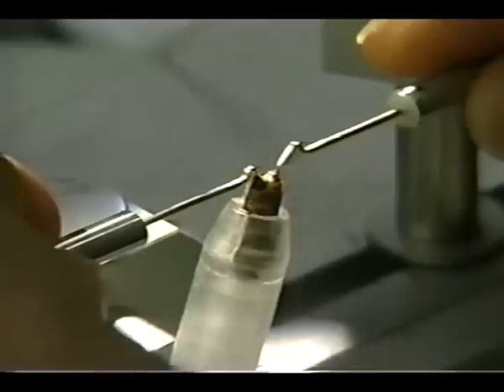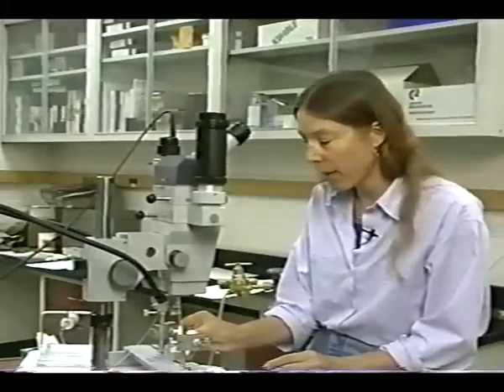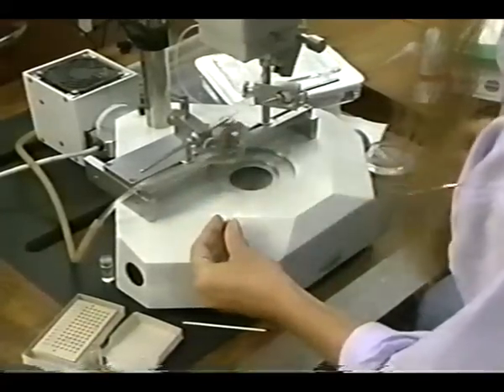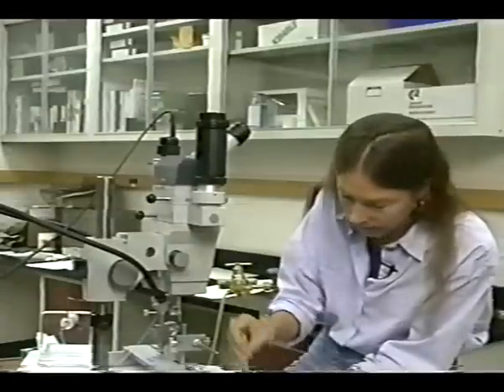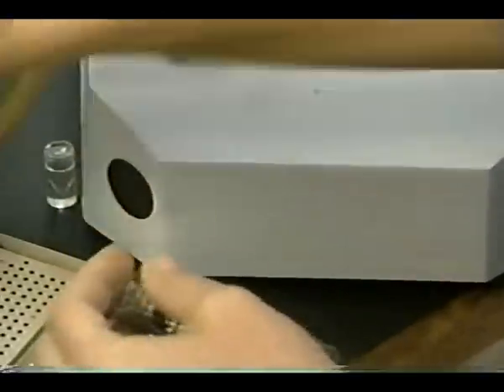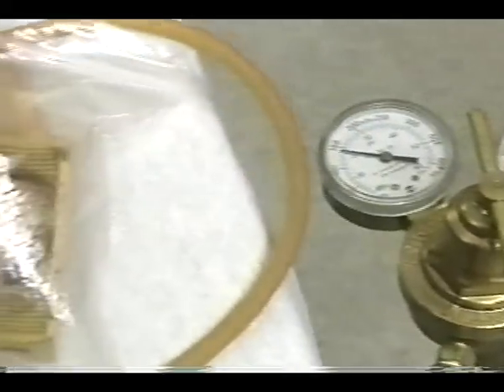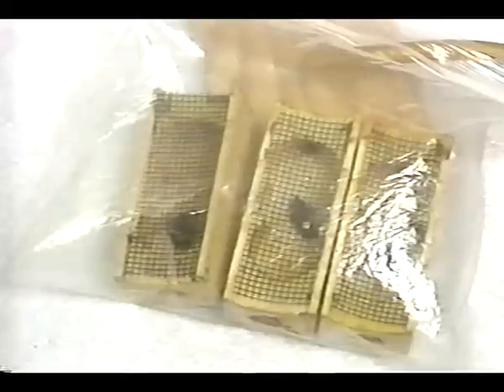To release the queen, push the hooks in and up, and the queen can be removed from the insemination instrument. Clip and mark the queen — we're going to put a number tag on her so we can identify her background. Now we're going to return the queen to her cage and put her back in a hive. The carbon dioxide used to anesthetize the queen is also important to stimulate oviposition, or egg laying. Two CO2 treatments are required: one during the procedure, and a second either before or after insemination by placing queens in a container filled with carbon dioxide.